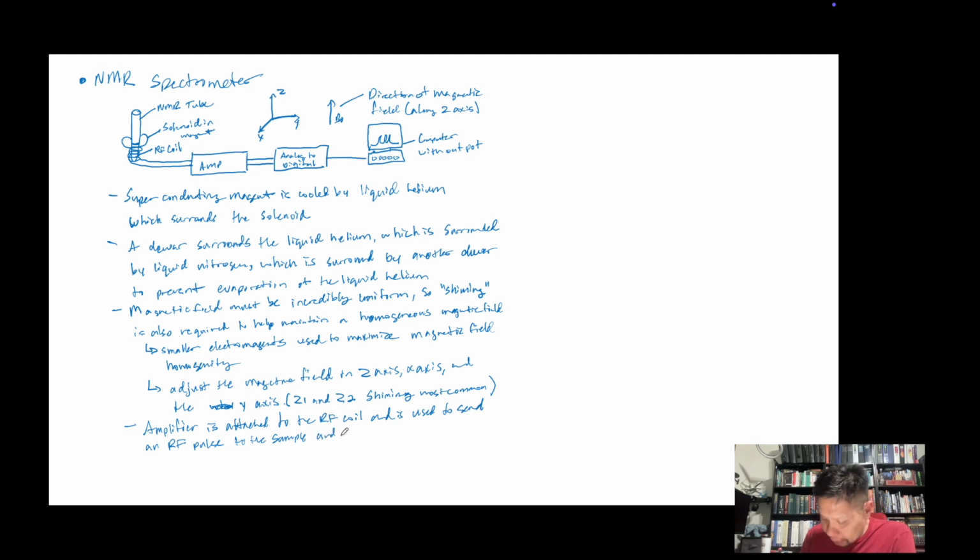And it is also used to record the resulting signal, which in this case is a varying voltage, which we'll discuss more in a second, right?